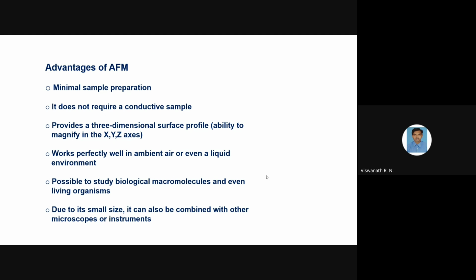The AFM technique is nothing but an atomic force microscope. It measures the force and fixes the force in a constant region, which is considered as a reference. It starts to raster around that region and maps out the atomic configuration.